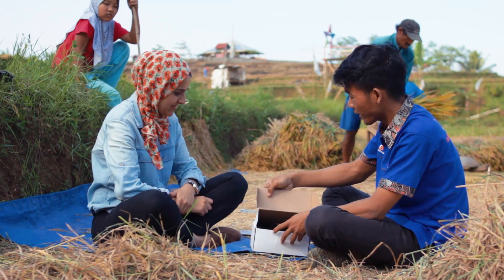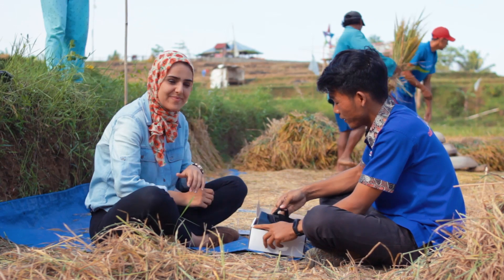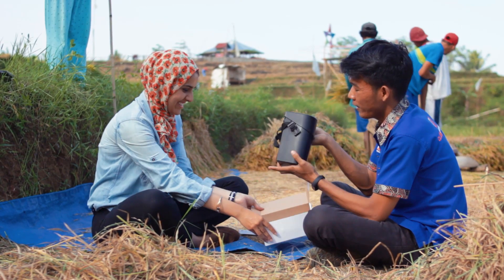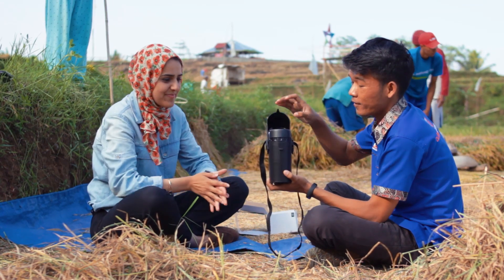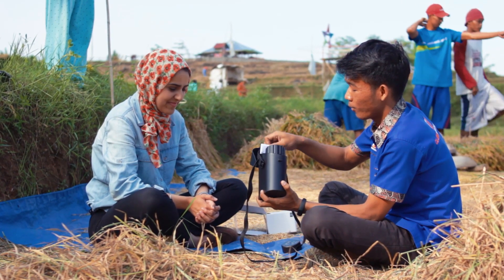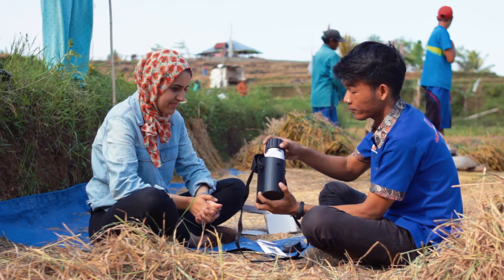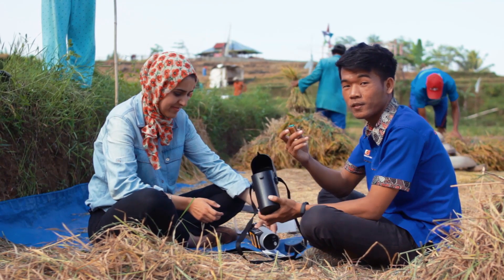Di dalam box ini terdapat apa saja? Di box ini terdapat sebuah tas. Kemudian di dalamnya ada alat ukurnya, kemudian ada manual book, kemudian ada baterainya.